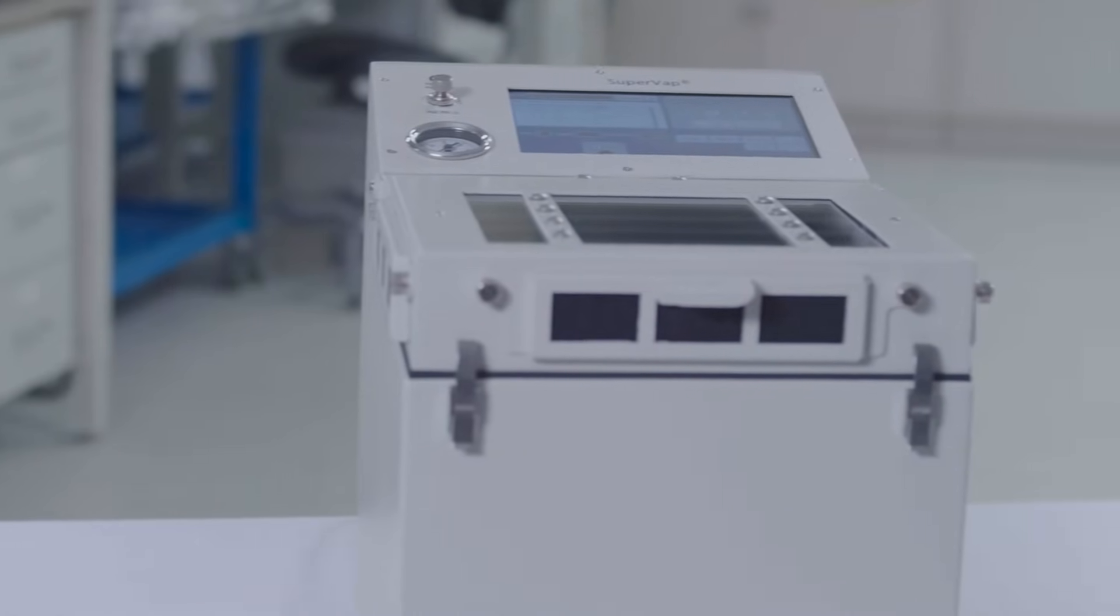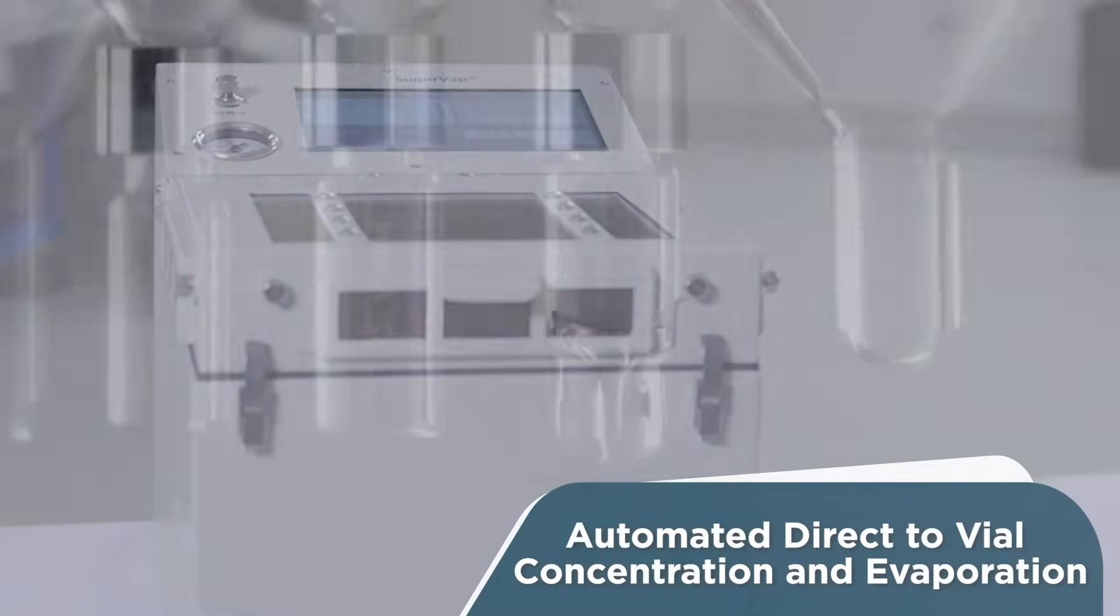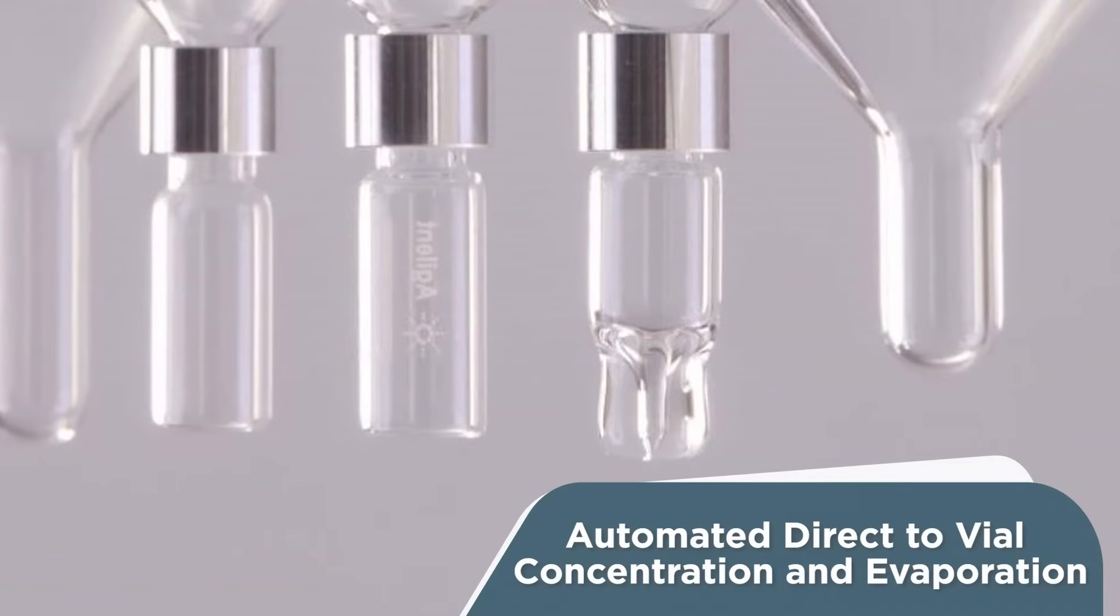Samples are concentrated for unattended transfer directly to a vial, eliminating errors that occur during manual transfer.